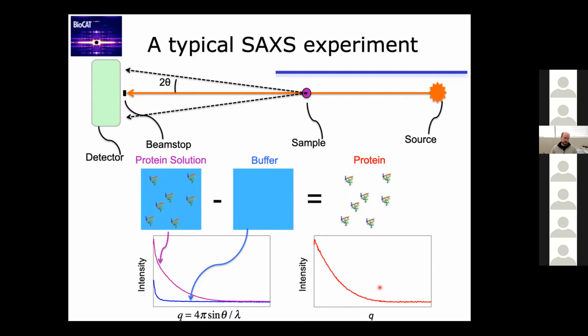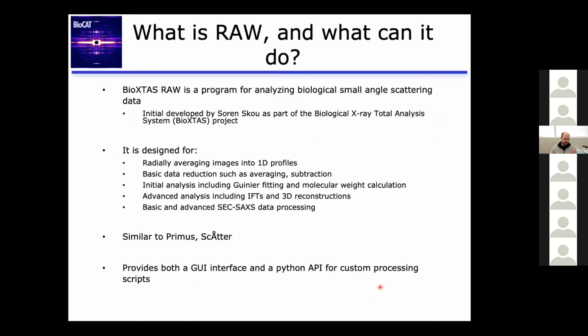And this one-dimensional profile is what contains all of the information about our standard solution SAXS experiments. So that's the very brief 3-minute introduction to SAXS.